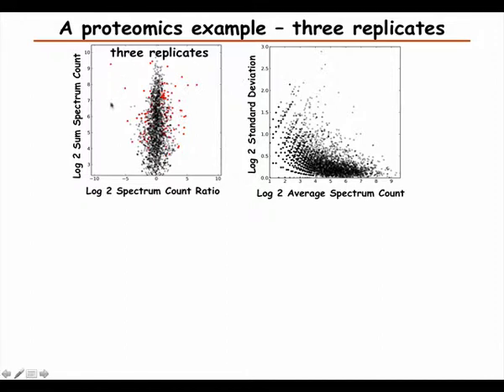And now we have done a t-test, and the ones that are red are the ones that are significant from a t-test after a multiple testing correction. And it might be a little bit difficult to see, but you see quite a few of the gray points that are still quite far away from this. There's one here, here that are surrounded by significant ones, but they are not significant themselves.